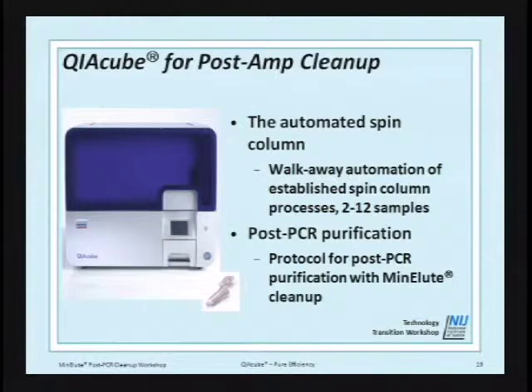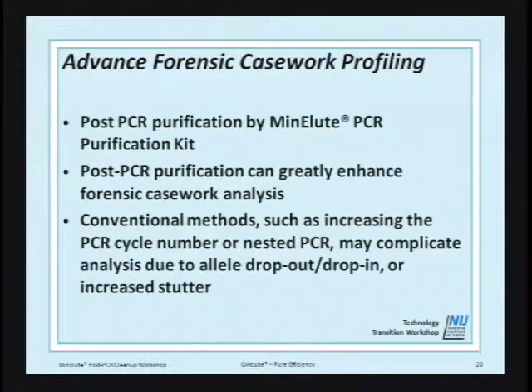So we were using the QIAcube yesterday for MinElute cleanup. It's able to process anywhere from 2 to 12 samples on our mini spin columns. As we saw, it can greatly enhance forensic casework analysis, increase your profile, visibility of your profile.